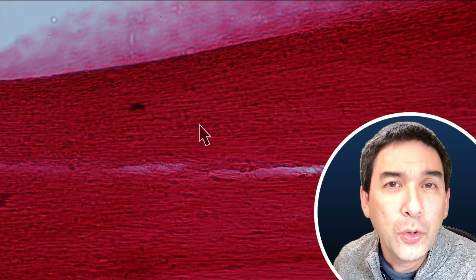Here in the center is another thing I'd like to show you. These look like interesting fibers running in parallel. When I saw this the first time I wondered what it could be. Zooming in from 20 times to 40 times — look what we're able to see. Those parallel structures here are most likely collagen fibers. Collagen is a very tough protein, and what we're looking at here is most likely the so-called tendon of the finger. Tendons are the structures that connect the bone to the muscles. Those fine parallel running lines are very typical of collagen protein.